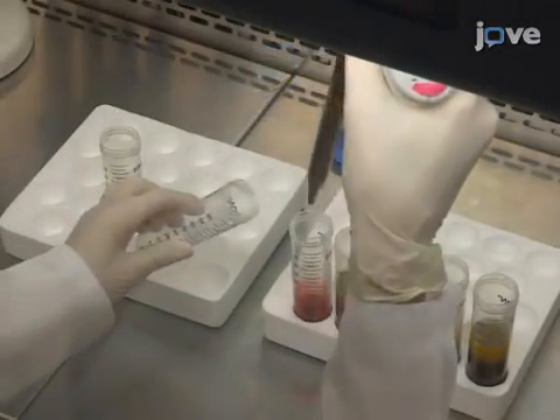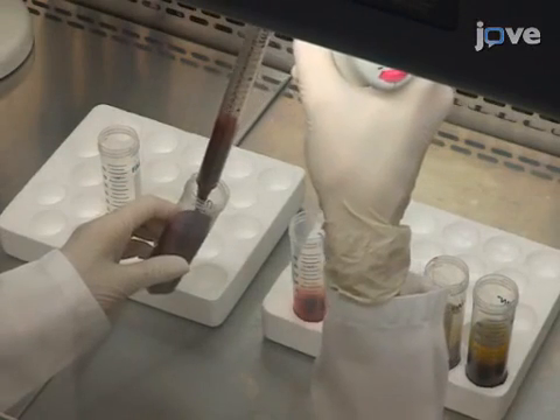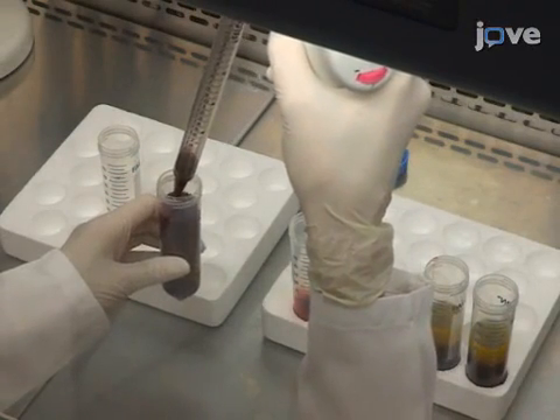Then, use a new 25 milliliter pipette to combine the mononuclear cell boundary layers from two of the tubes in a new sterile 50 milliliter conical tube.